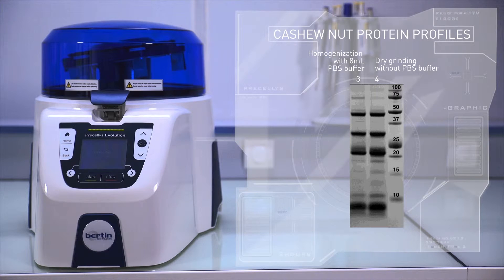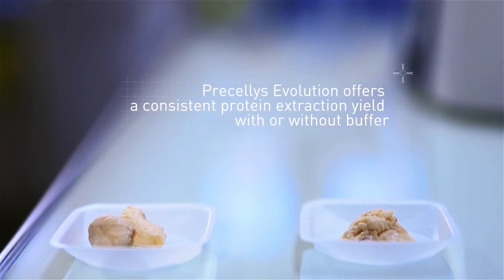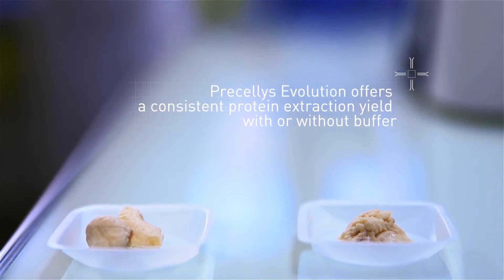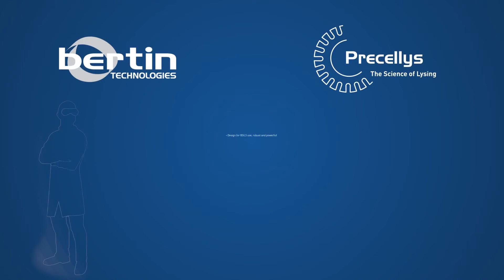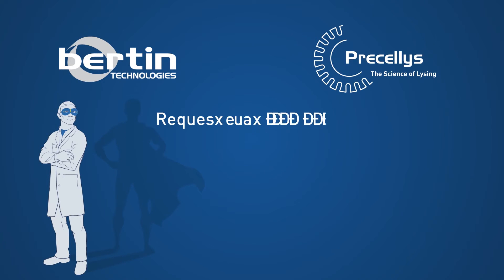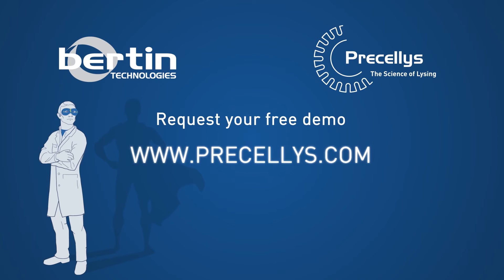Pressilis Evolution is suitable and convenient for protein extraction from dry or hydrated samples without buffer, which is a real advantage for obtaining highly concentrated proteins. Request your free demo on Pressilis.com.